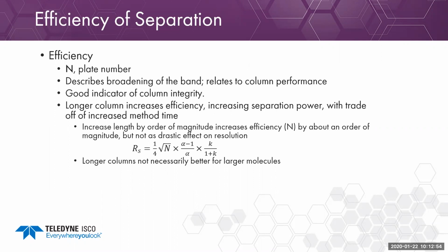Another thing to note, if you're working with larger molecules, proteins, things like that, longer columns aren't necessarily going to provide greater efficiency for larger molecules. So keep that in mind. For small molecules, though, longer columns are going to provide better separating power.